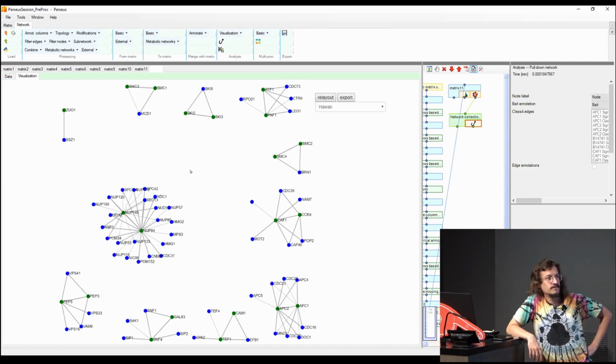My question is about the use of the complement as the negative control. I can see why that works very well for proteome-wide interactome studies. Would that perform as well for more targeted proteomics? Targeted meaning that you have a few baits, because would that bias against having two proteins with the same binding partners, and by using the complement when analyzing each bait, you wouldn't see this binding partner?